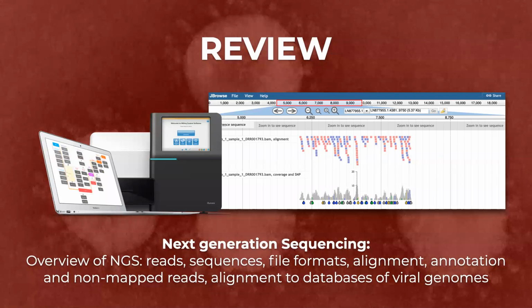And one of the bigger challenges in then understanding where those reads map to on the reference genome is called alignment or mapping.